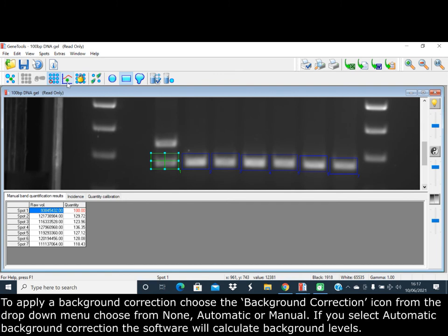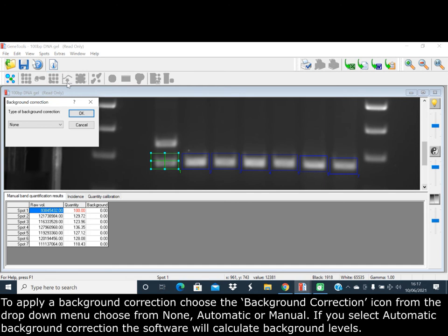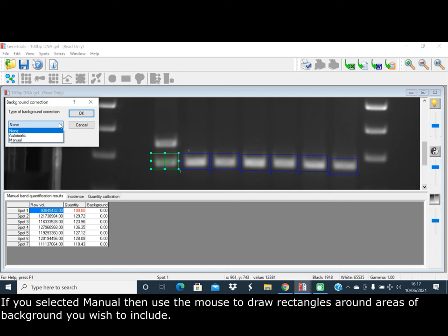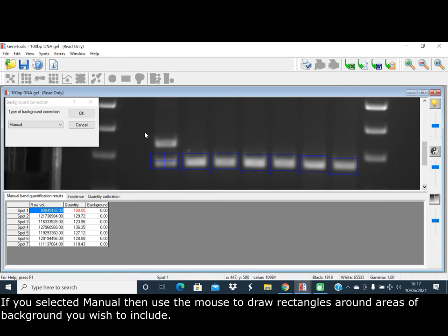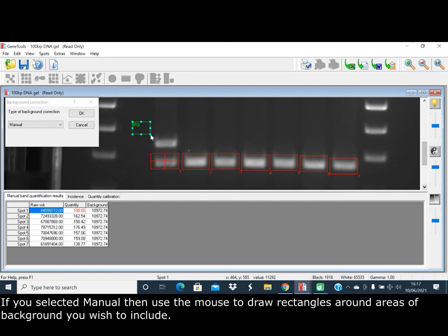To apply a background correction, choose the background correction icon. From the drop-down menu, choose from None, Automatic, or Manual. If you select Automatic background correction, the software will calculate the background levels. If selected manual, then use the mouse to draw rectangles around the areas of background you wish to include.